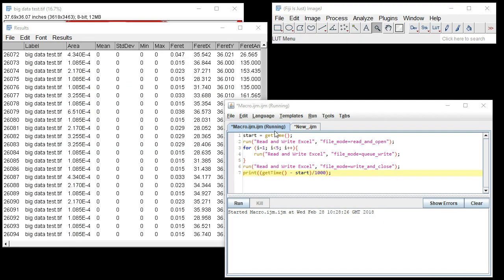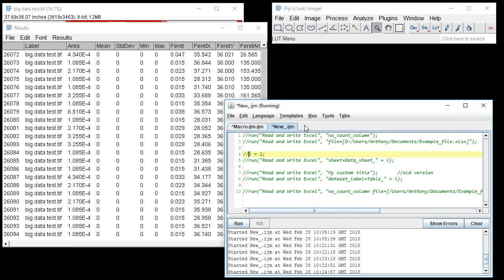But like I mentioned before, this regular implementation will be fine for the majority of users. Thank you for listening. This was a tutorial on the use of the Read and Write Excel plugin version 1.1.